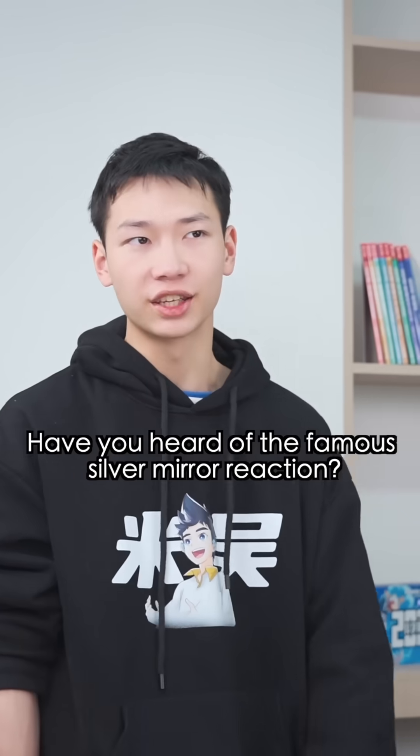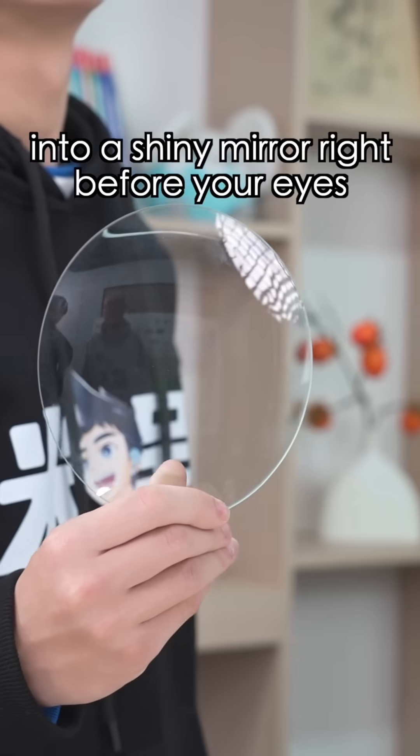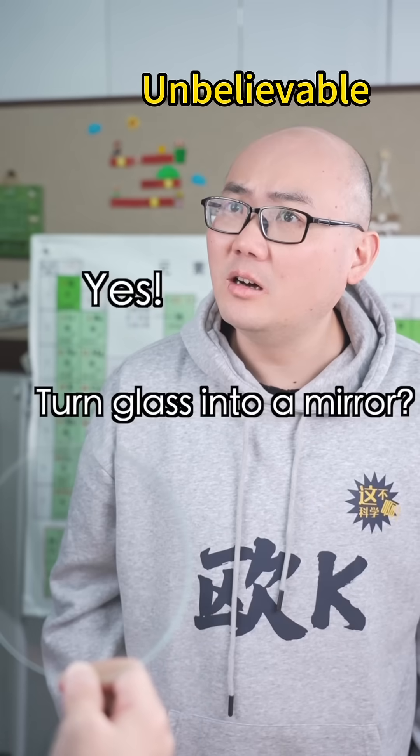Have you heard of the famous silver mirror reaction? The silver mirror reaction? Yes, it can turn this piece of glass into a shiny mirror right before your eyes. Turn glass into a mirror? Yes, let's find out.